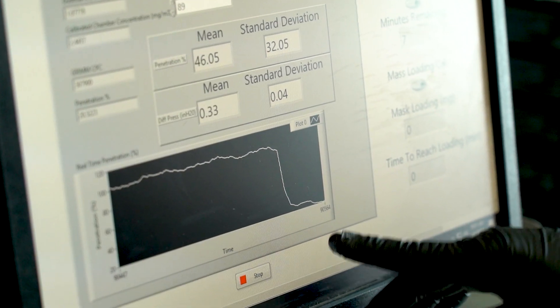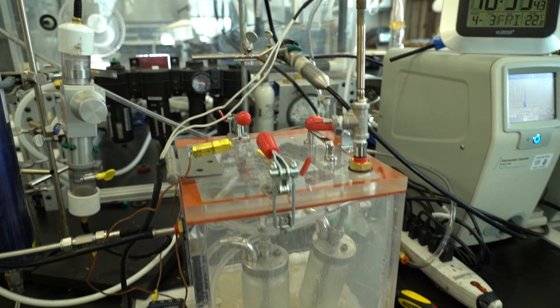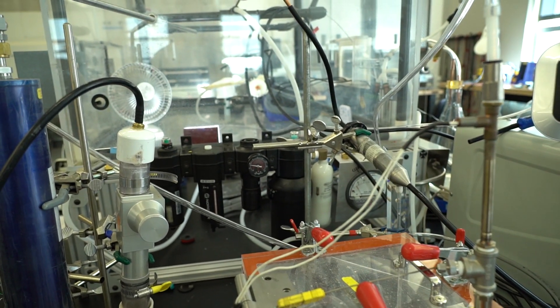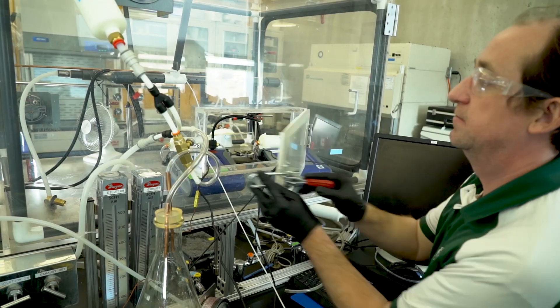At the same time we're also measuring pressure drop across the mask. It's not just about how well it filters, but a mask that has too high of a pressure drop actually puts too much burden on a person who's breathing and can be downright dangerous.